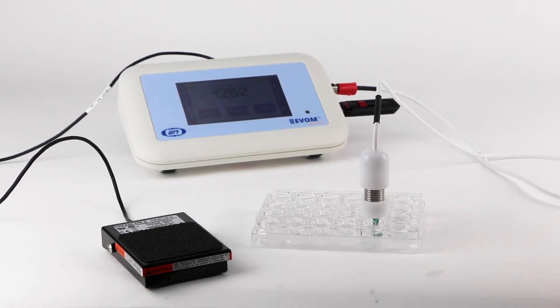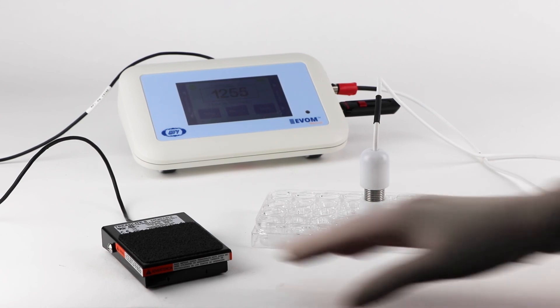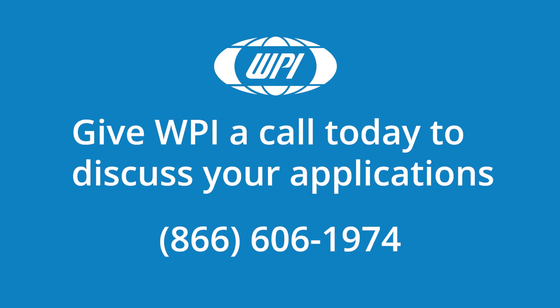Once you get our system set up, taking measurements is easy. If you have any questions, just give us a call.